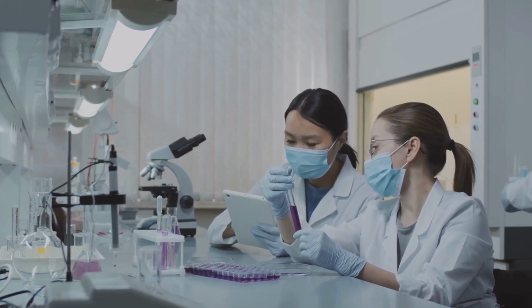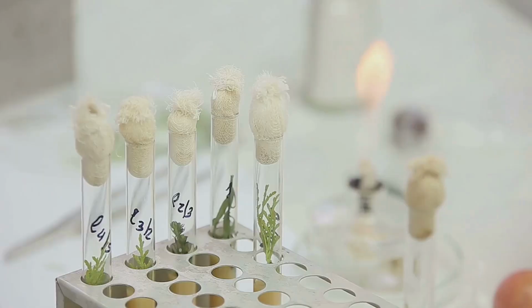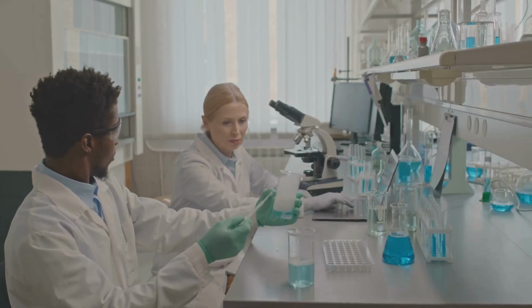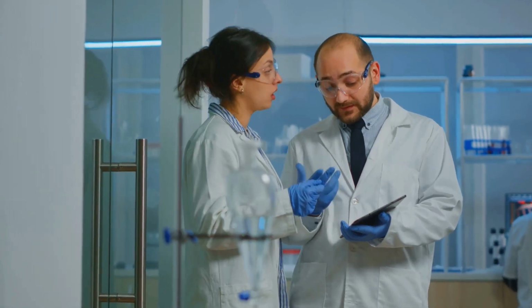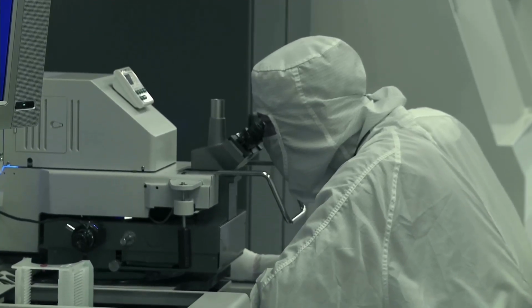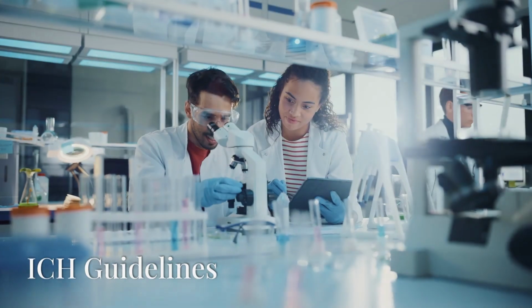Microbiology plays a vital role in ensuring the safety and efficacy of pharmaceutical products. Microbial testing has several key objectives. Objective: to detect and quantify microorganisms in pharmaceutical products. Techniques: this includes tests for total microbial count, specific pathogens, and sterility. The application of these tests is crucial. Sterility testing ensures that products intended for sterile use are free from viable microorganisms. Microbial limit tests measure the levels of microbial contamination in non-sterile products.